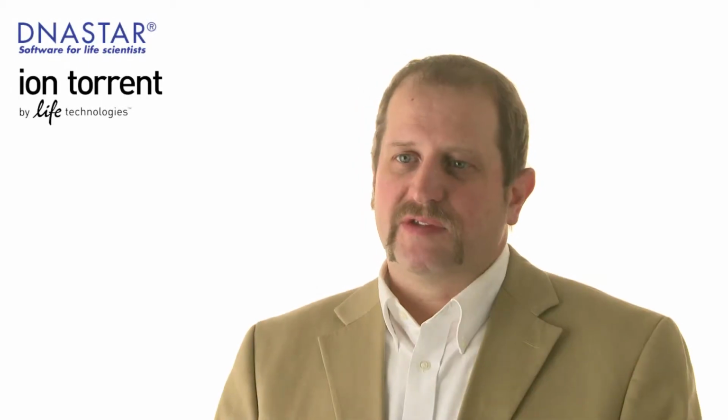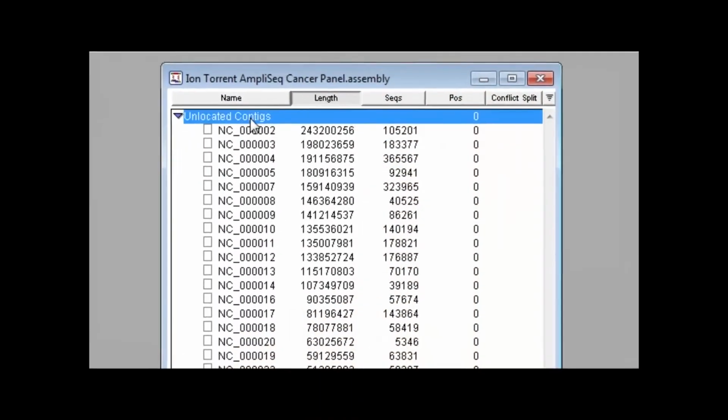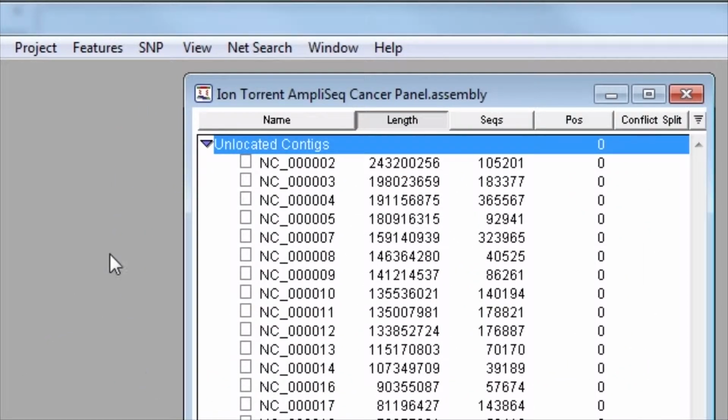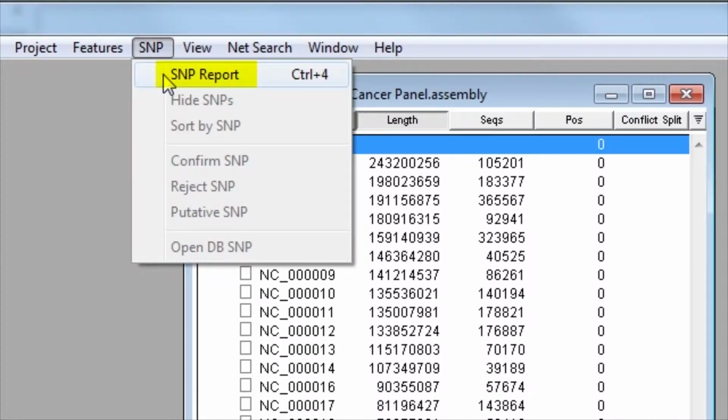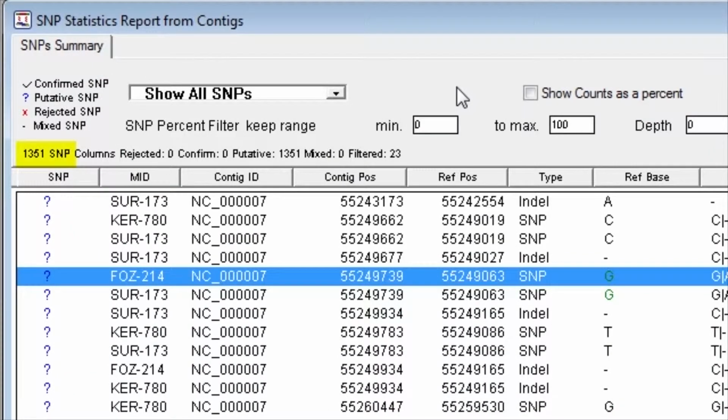The power of next-gen sequencing is really that you can generate massive amounts of data, right? That's the core competency of next-gen sequencing. It's what NGS does really well. It's also probably the thing that scares people the most because now they have all this data and they're not sure what to do with it, and it can actually be paralyzing to people.